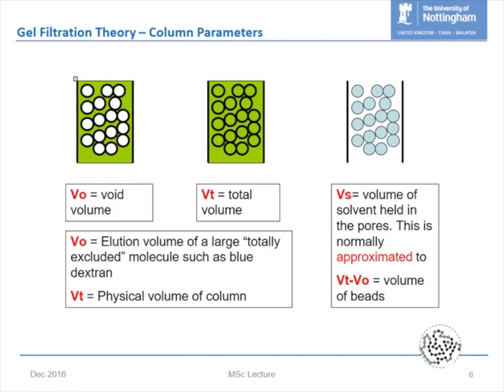Now what we actually do is we make an approximation, because it's very difficult to actually work out exactly what the volume in the particles is, because obviously the particle material, although it's only a small part, the structure of the particle, what creates the pores, has a finite volume. But in this approximation, we're just basically going to say that the analytes have access to the whole volume of the particle.